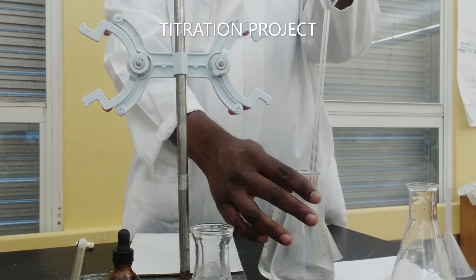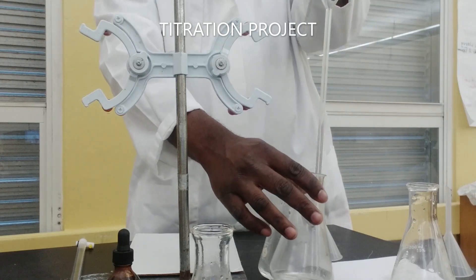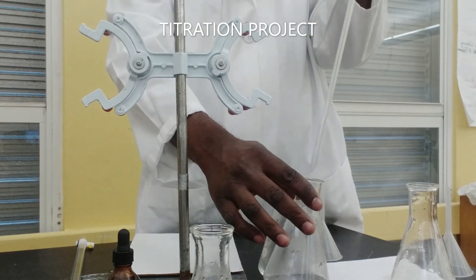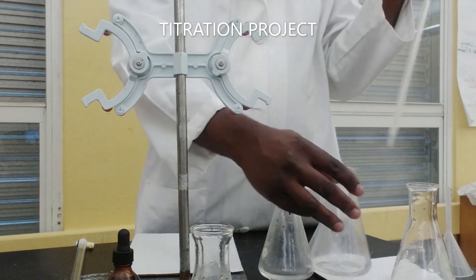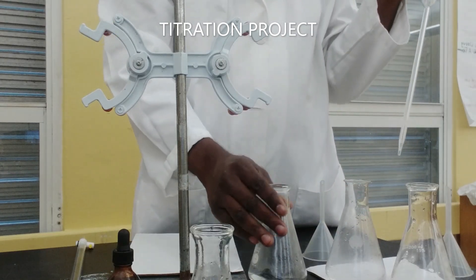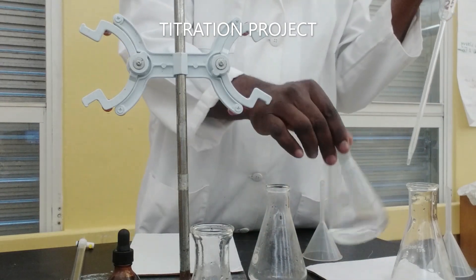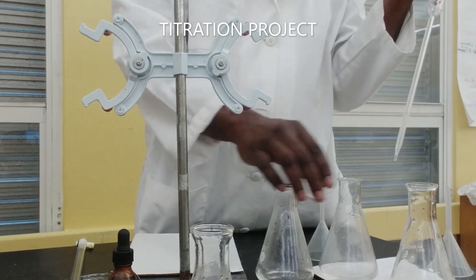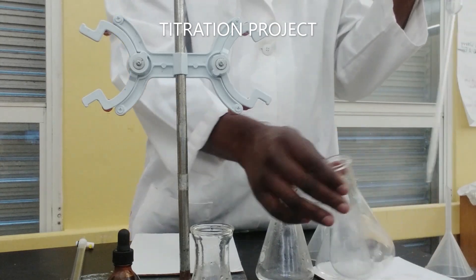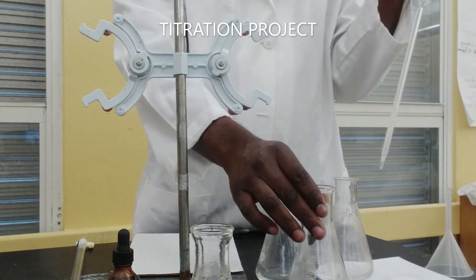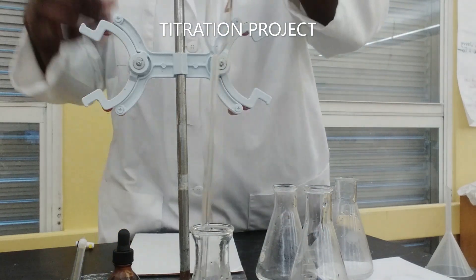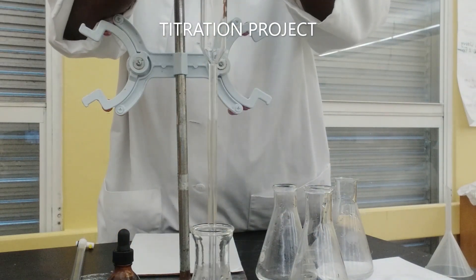So I intend carrying out three trials of my titration. I'm going to have 25 milliliters of acid transferred into three of my flasks. So here we go for the third one.